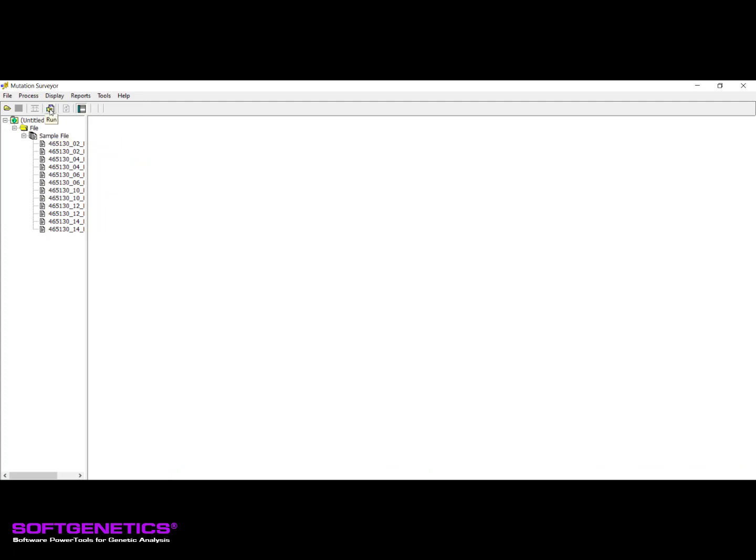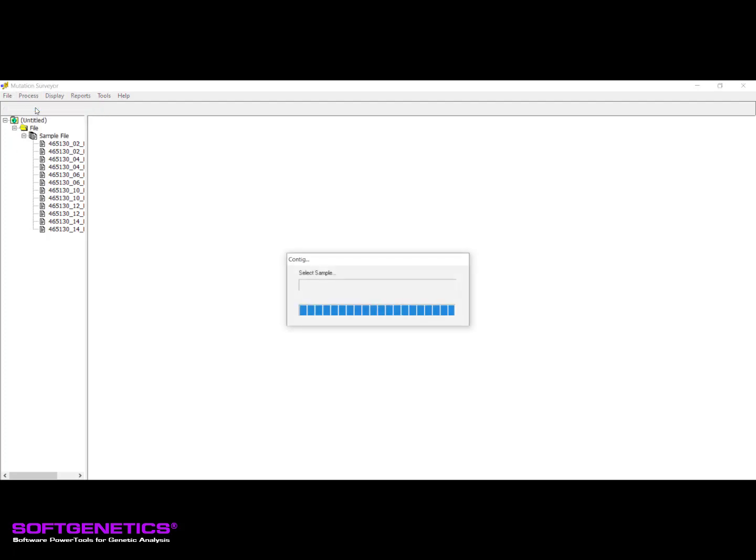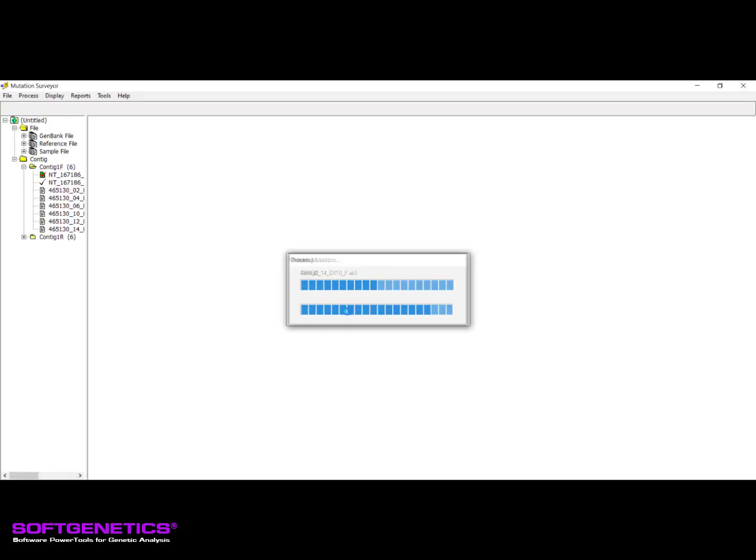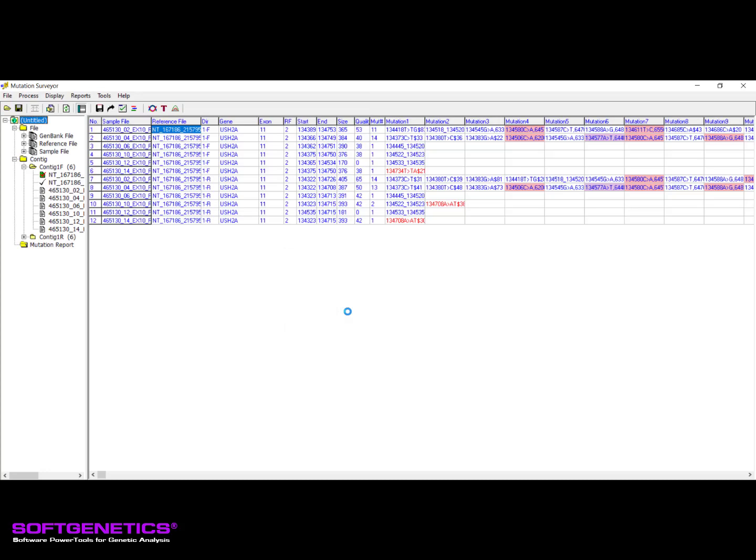When you are ready to run the project, click the Run icon or go to Process Run. Samples will be grouped into contigs based on sequence start position and sequence similarity. Overlapping forward and reverse directional sample trace files will then be paired and traces will be aligned. If a GenBank file was not manually loaded, the software will first check a local location for a matching file and if none is found, it will connect to one of our databases to download a matching GenBank file to your computer. At the completion of the analysis, grouped samples will be displayed in contig folders located in the left pane and the mutation report will be displayed in the right pane.